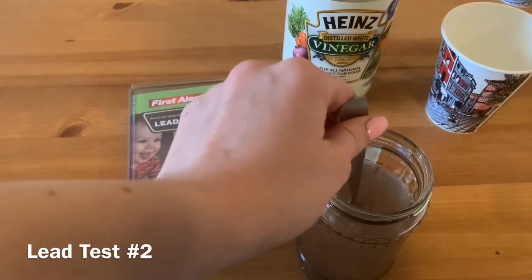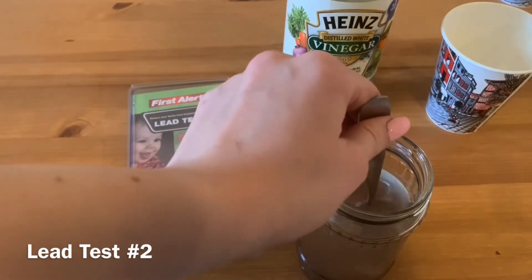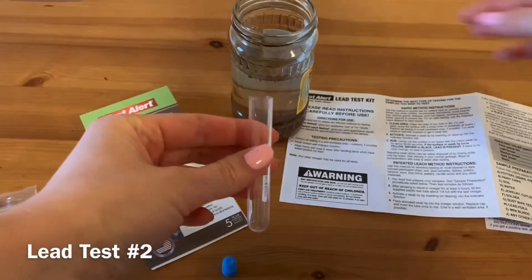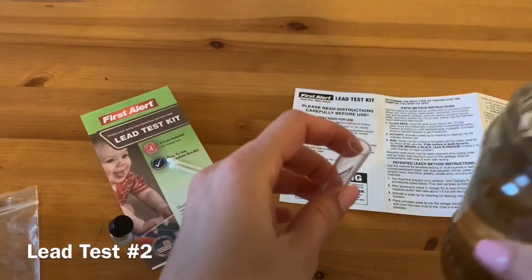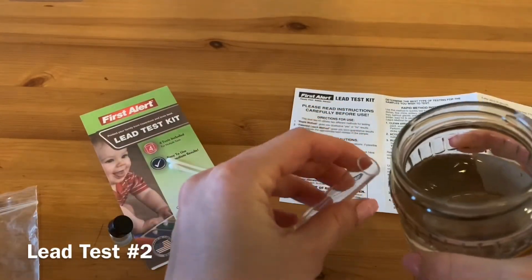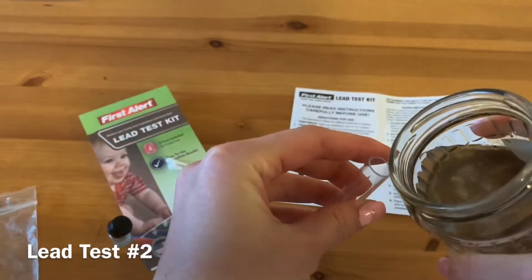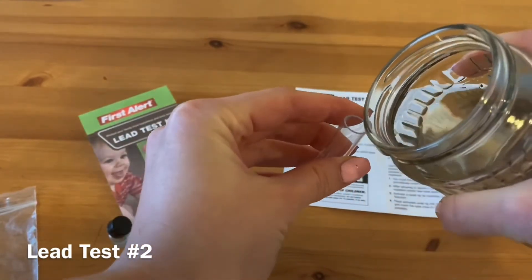Allow to stand uncovered for a minimum of 4 hours and then follow the procedure further. After allowing the soil to stand in vinegar for at least 4 hours, fill the supplied plastic test tubes about one-fourth full with the test vinegar.